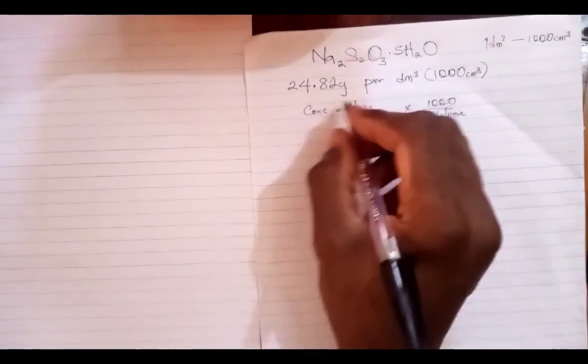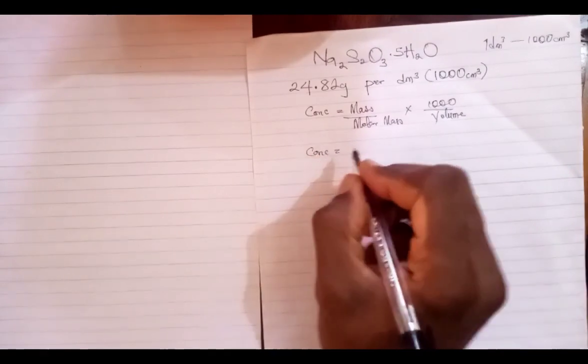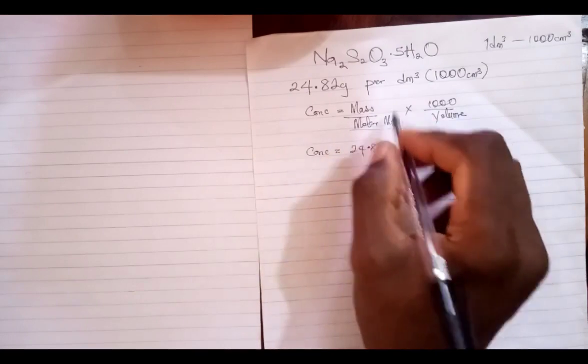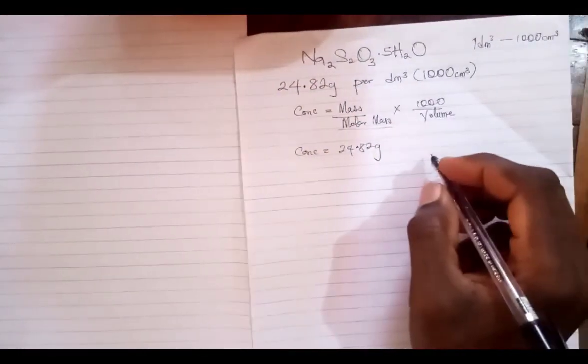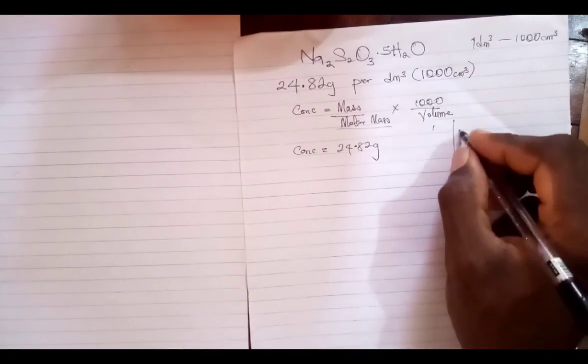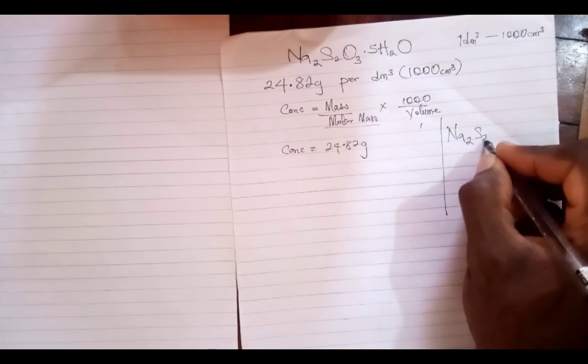The mass is 24.82 grams. Then you calculate the molar mass of sodium thiosulfate, and this is how you do that.